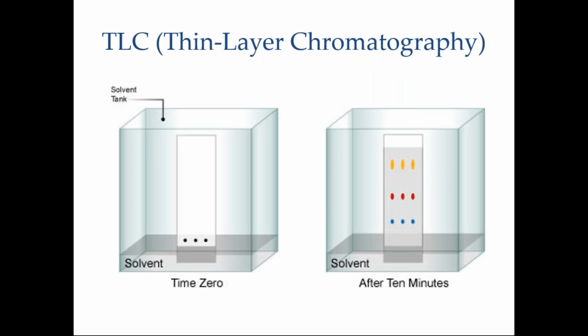So here is a thin layer chromatography setup where you have the thin layer chromatography chamber, you have the solvent boat, the plate with the layer of it at 0 time, and the solvent tank is generally covered.